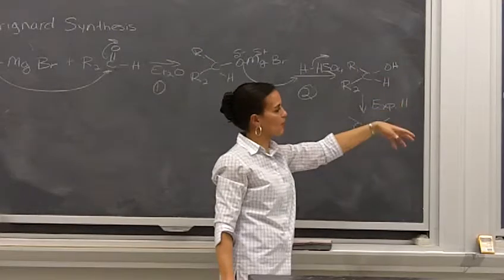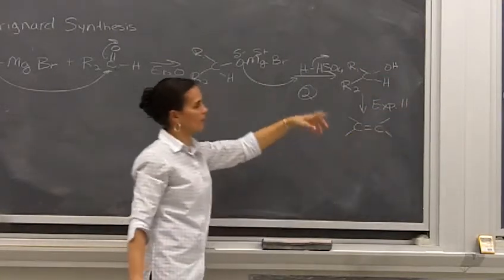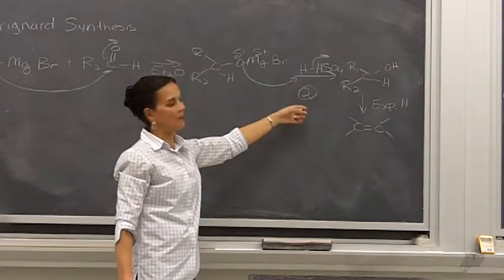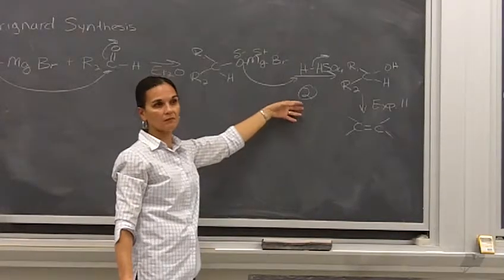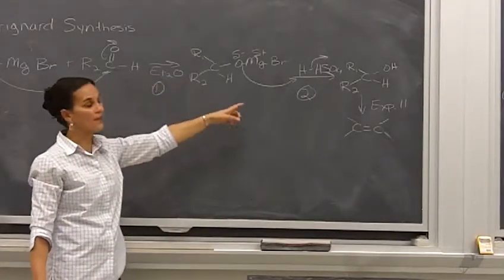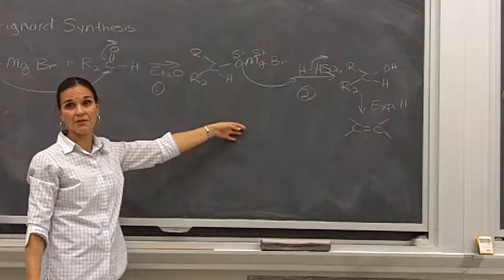Throughout this experiment, you probably want to wear gloves. The alkyl bromides can be kind of irritating. The aldehydes smell, and so if you get some on you, you may carry the smell around with you for a little bit. But with the sulfuric acid, you don't want to burn yourself with it.